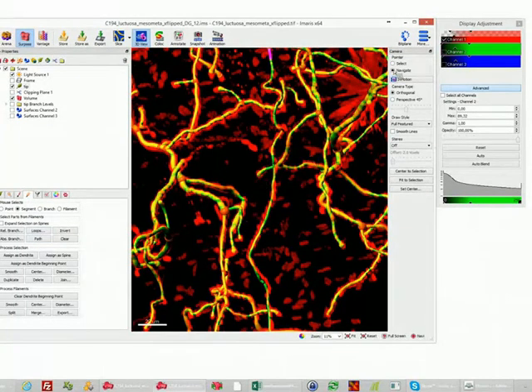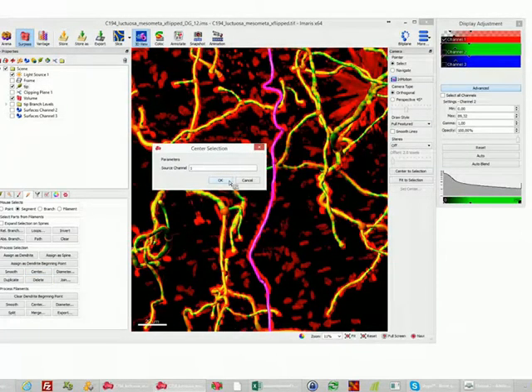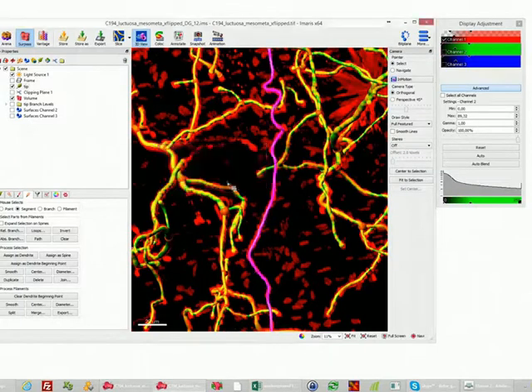and then I select my drawing. It will highlight, and there is a tool which is called Center. This will recenter the line to the brightest intensities in the surroundings. If you look closely, maybe you will see it snap. So I press it. I have to tell it which channel I want to work on, the first, red channel, and now it will snap it to the center.